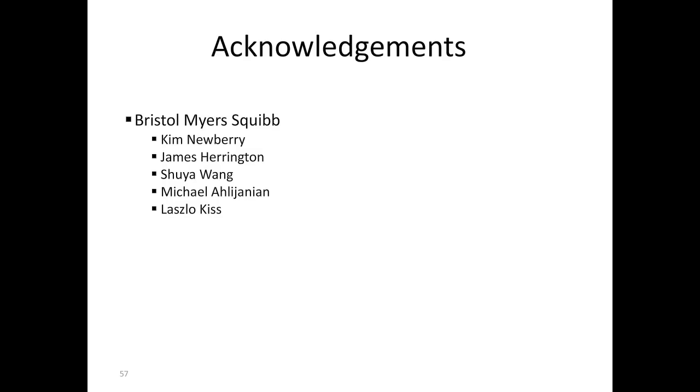Great questions. We are not yet selecting them on the GFP reporter for the experiments that I have shown. We are starting to sort them in the next follow-up experiments, just to study specific subtypes of neurons isolated. When we do that, we would add glia on the bottom as coating, and we also coat the plates with polyornithine laminin, which is a general coating described in the literature. We don't use glia now, but as soon as we sort cells, they wouldn't necessarily survive very healthy without the glia. The reason we don't add glia right now is that our populations, differentiated from neuroprogenitor cells in the MEA plates, already have a specific percentage of glia cells that is constant.